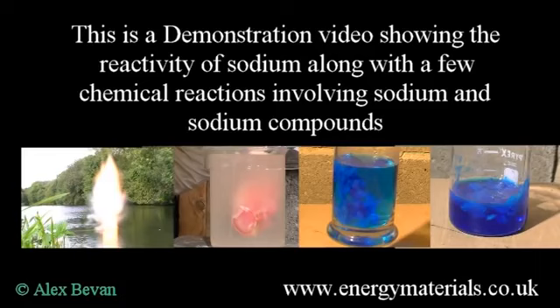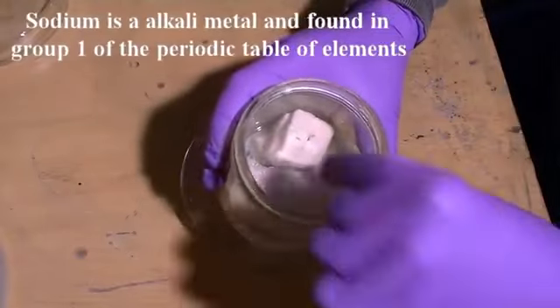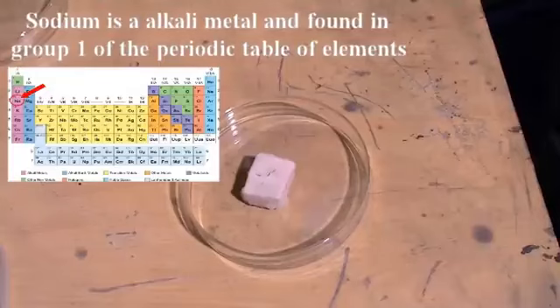This is a demonstration video showing some of the chemical characteristics of sodium metal along with some of the chemical reactions of sodium and sodium-based compounds. Sodium metal is typically stored in mineral oil, as sodium metal would react with the humidity in the atmosphere.